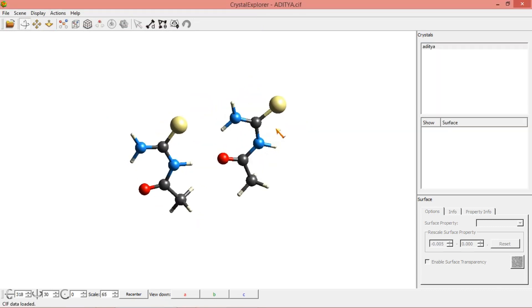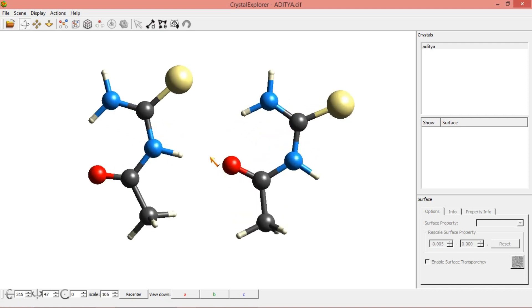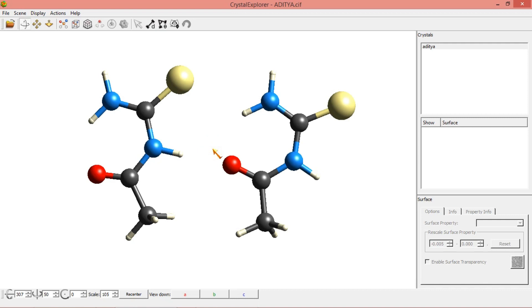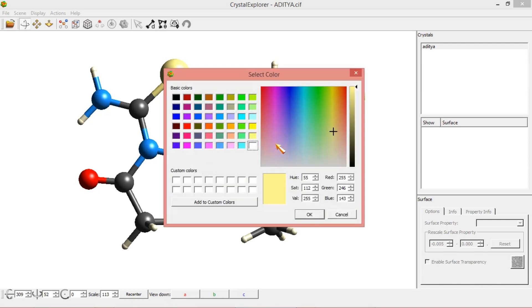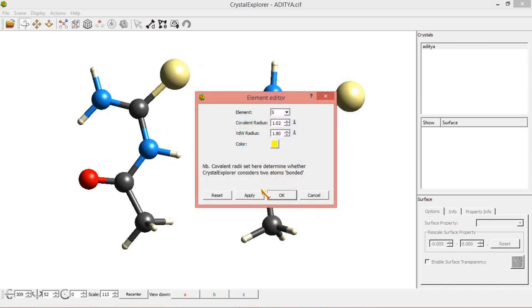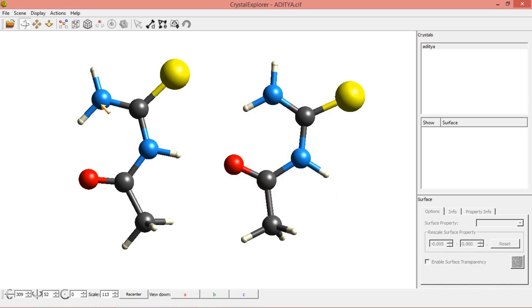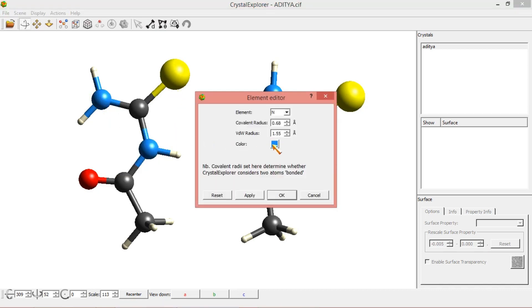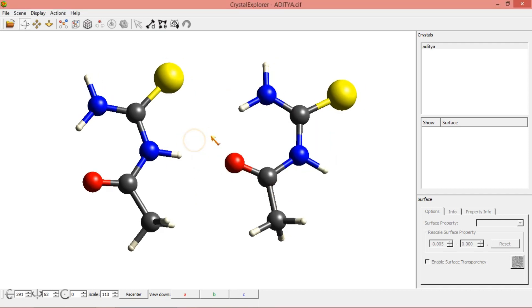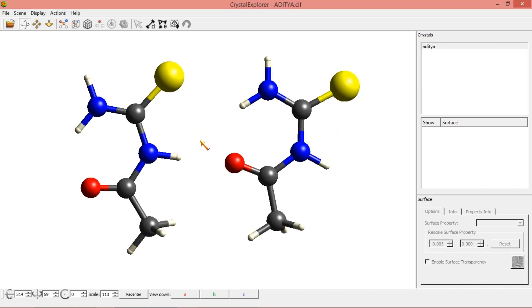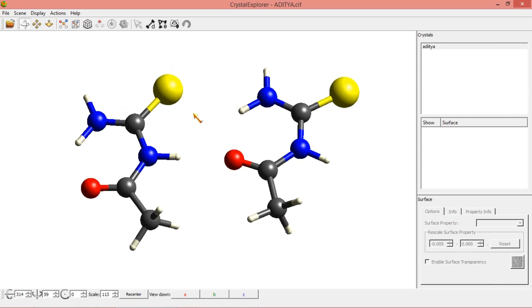I have opened a CIF file — CIF means Crystallographic Information File. This is the molecule we are seeing now. This is a sulfur molecule and these are the nitrogen molecules. I am coloring this nitrogen-sulfur molecule into yellow color. As a standard, nitrogen is blue color, so I am changing this into blue color.